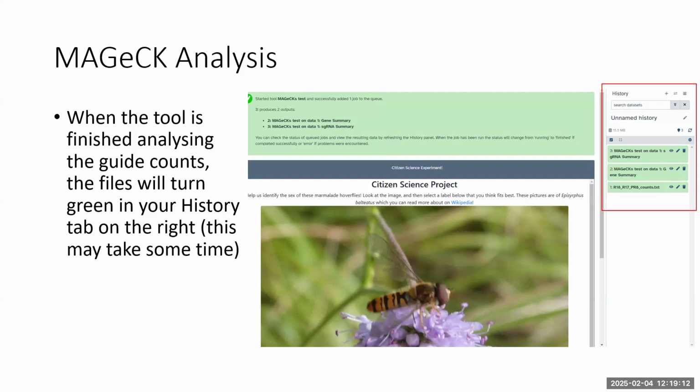Okay, have those turned green yet? Oh yeah, okay. So there's a little eyeball icon next to the icons, and I think if you go to the top one there, and then go to the middle one with the eyeball icon. That's essentially your data there, and it's already sorted it into a list of the top hits.